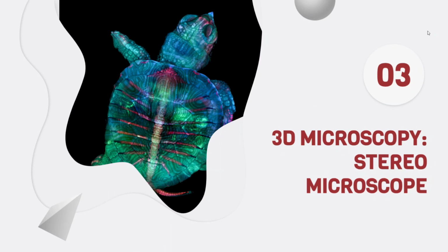Due to its low power range and surface view capability, it's most often used in entomology and parasitology. A second technique I'd like to present to you is 3D fluorescent microscopy.